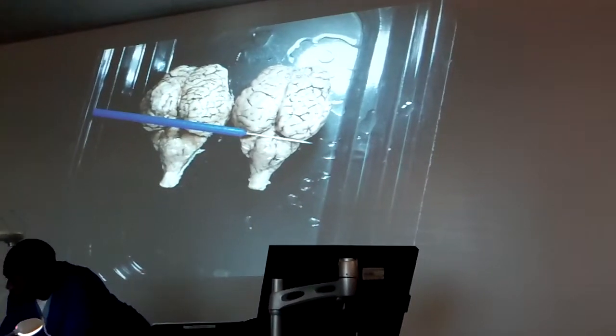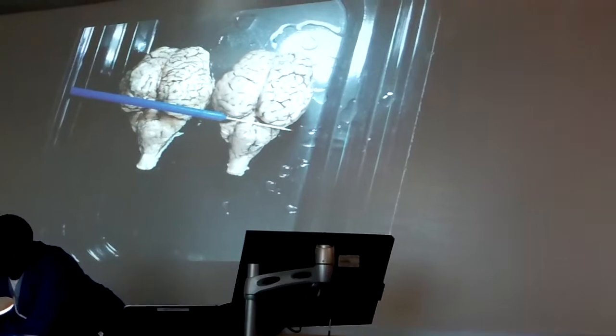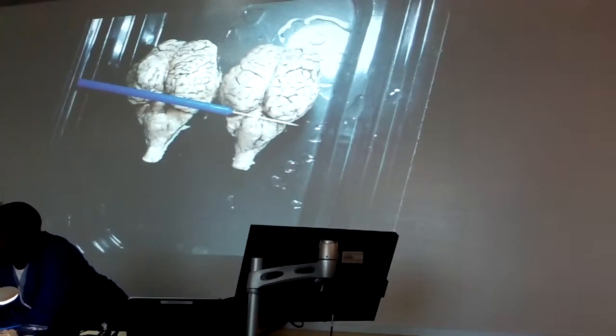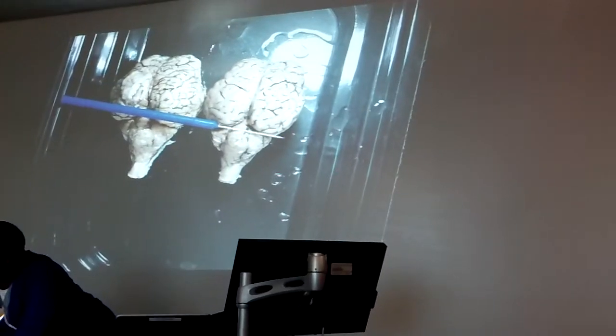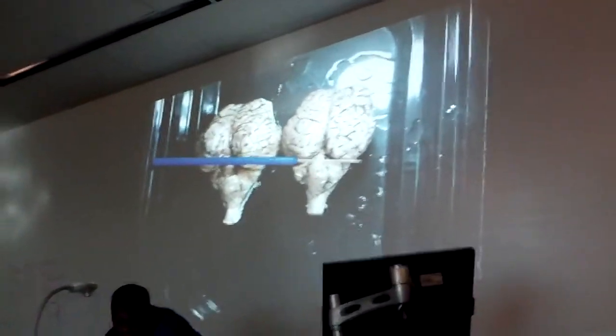Mr. I don't know where you're getting this stuff from there. I don't. Look at number 3 on your list. It says longitudinal and transverse fissures. That's what we're talking about now. Now, when it says cerebrum, it wants to know what the 2 hemispheres are. The cerebrum, Mr. Gilmore: here's the left hemisphere, and here's the right hemisphere.